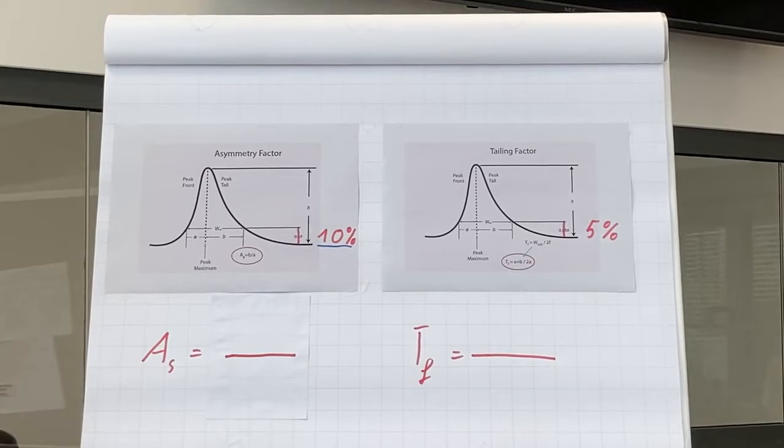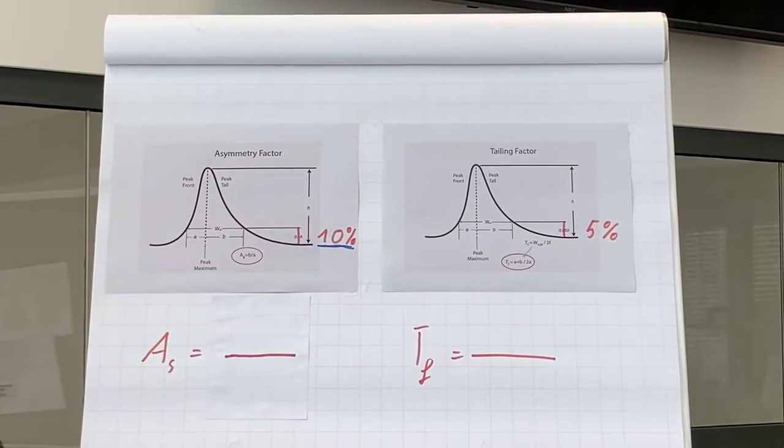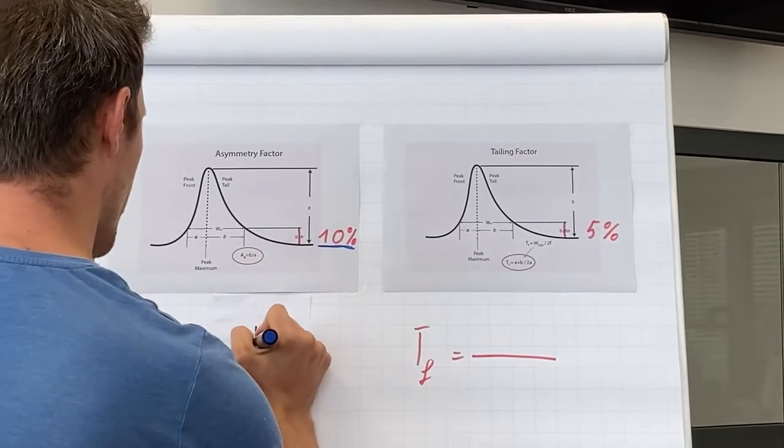Let's start with the asymmetry factor. The asymmetry factor is measured at 10% peak height above the baseline and is calculated with the following equation: A plus B divided by A.